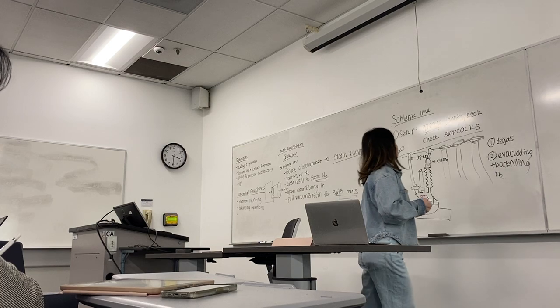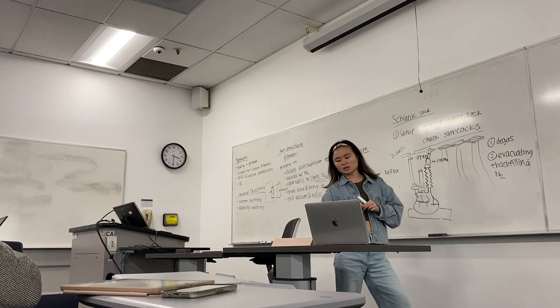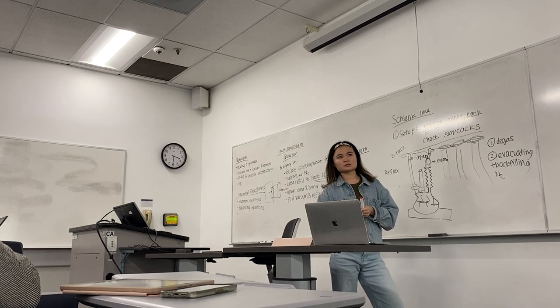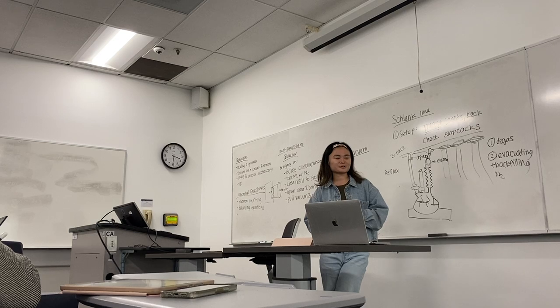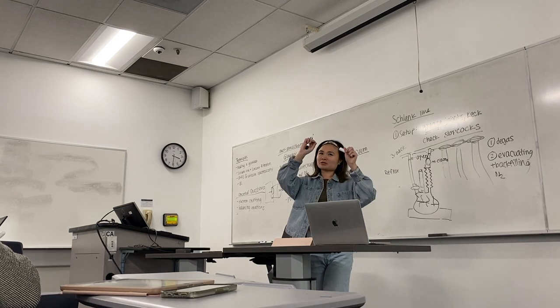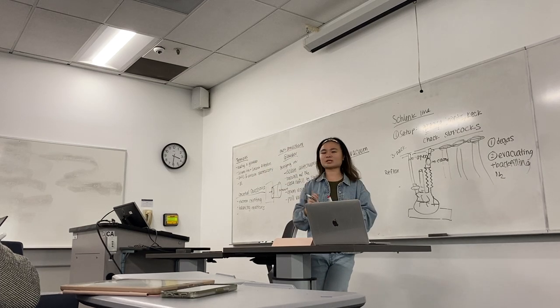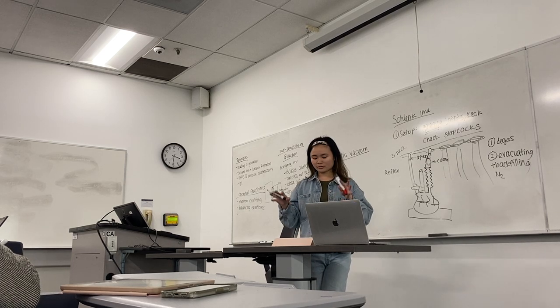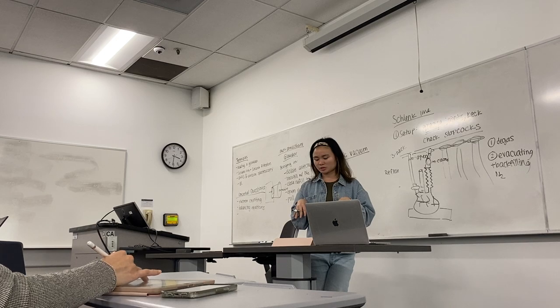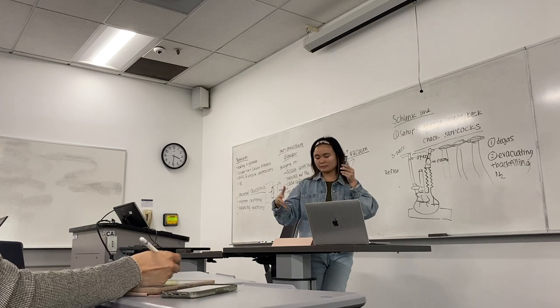My main thing is, I guess, with the Schlenk line, understand the more. I think the hardest lab we did this quarter, technically speaking, was MMT, because you had to use a Schlenk filter, and then once you assemble the filter, I close the stopcock, pull vacuum to filter it, etc. So I would just make sure to be familiar with the MMT Schlenk filtration, keeping in mind the order of the steps.